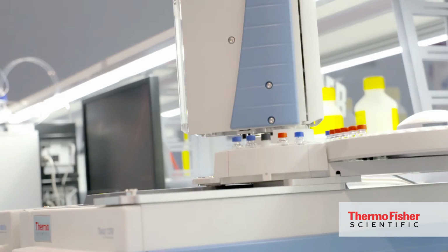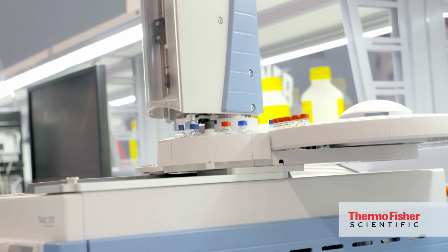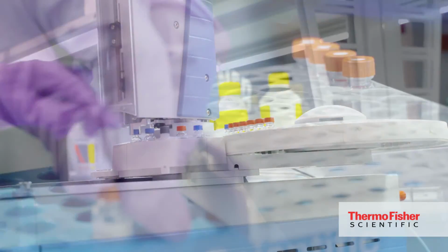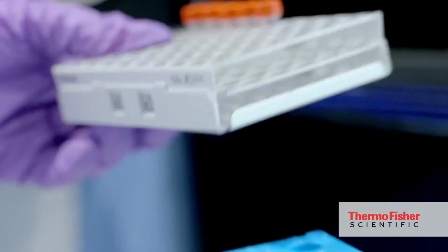So we are injecting in both LC and the GC MS systems. First, we just put the sample into the GC tray. So the other sample will be put into the HPLC autosampler.